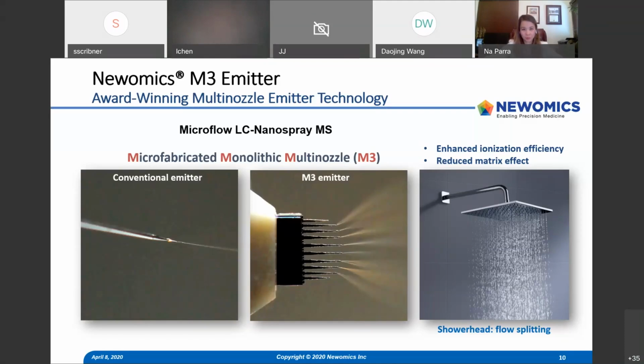Although we didn't actively work on the product for the first several years, it did take us several years to really optimize the design and get the flow running as expected, so that the design optimizes ionization without causing the droplet issue. So I hope this answered the question.